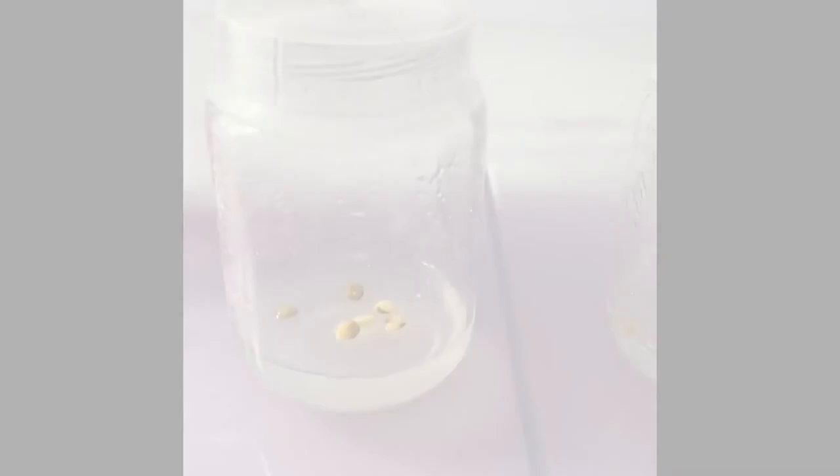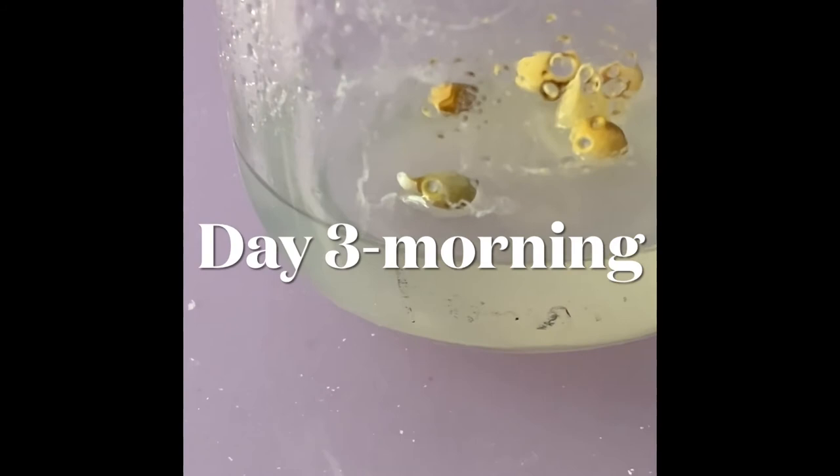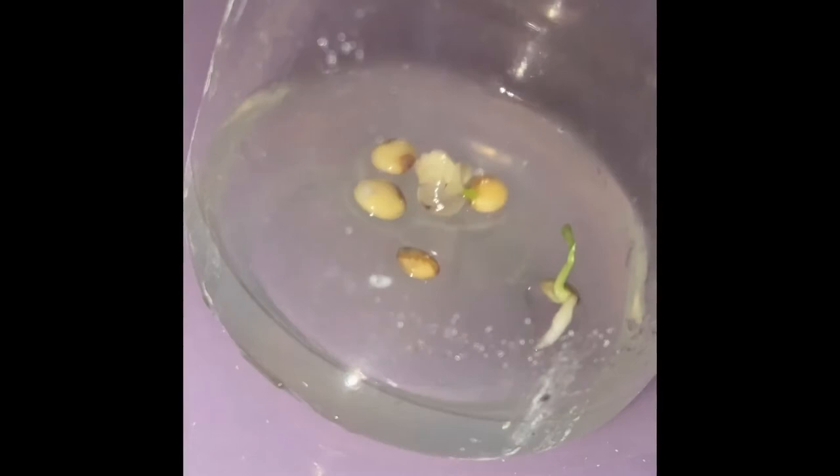The second day, one lentil seed began to open in half, while the tomato seeds stayed the same. The third day, one lentil seed started to germinate in the morning. On the fourth day, a little plantlet started to emerge from a lentil seed, and at night, another one arose from another seed.